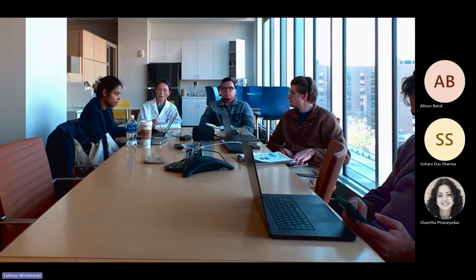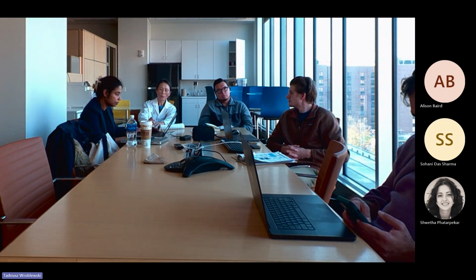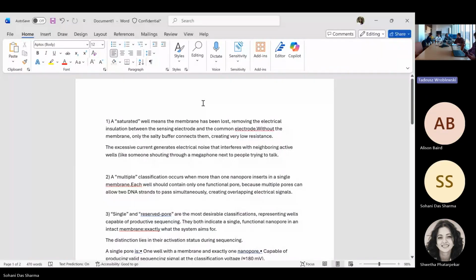Yeah, absolutely. So when you use a 1 ml pipette to load the sample in the port, you do it like this. You use your finger to pull it. I was thinking about the 1 ml tip, just a touch, or you can press or loosen it. No, I was just touching it. Just touch it, that's okay. There is no perfect protocol for that.